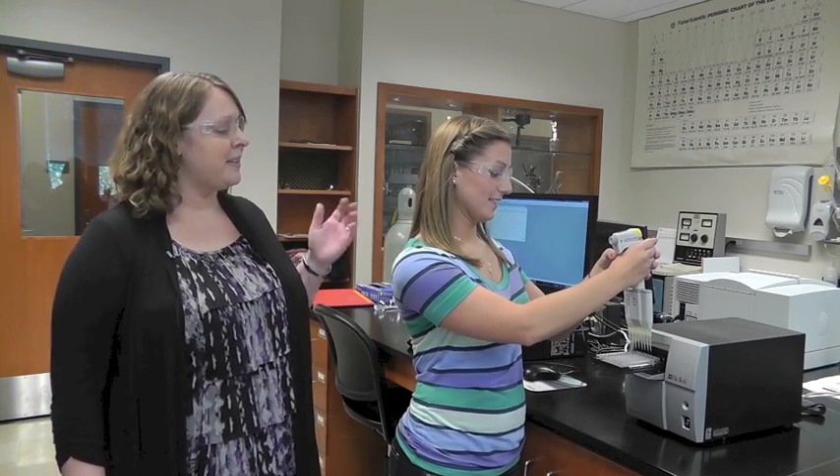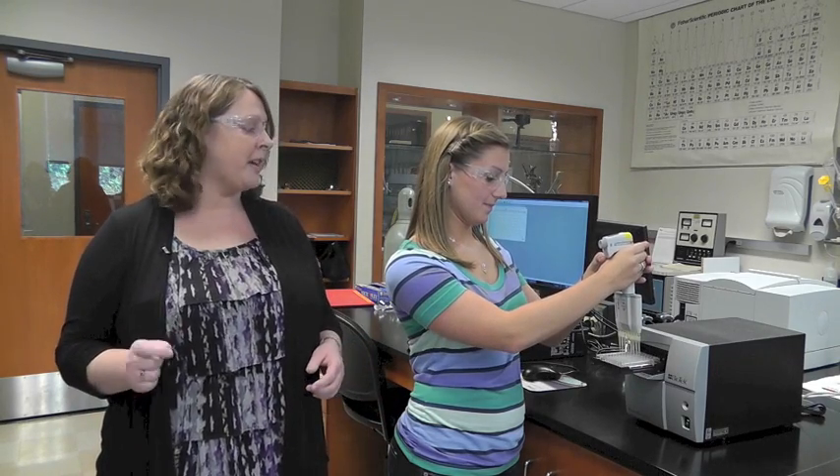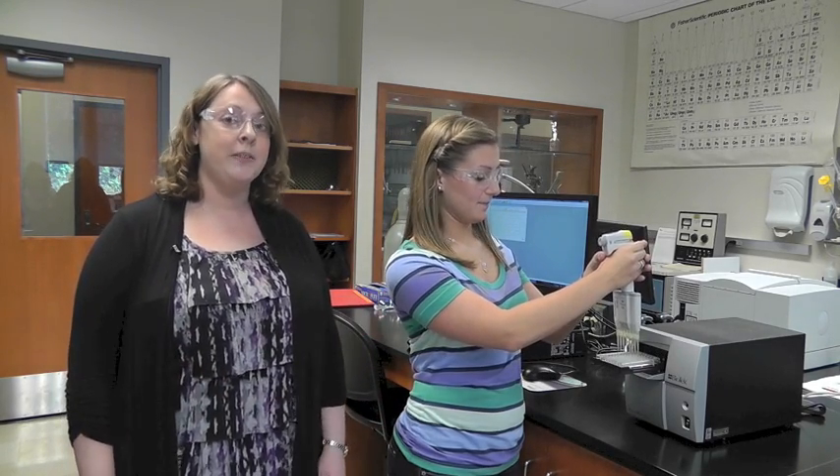Hi, my name is Dr. Deb Boyd Kimball and this is Alyssa. We're working with a microplate reader which reads the absorbance of small samples in a short period of time. We often use this to measure the activity of enzymes.